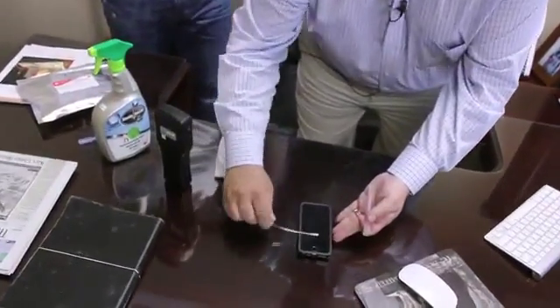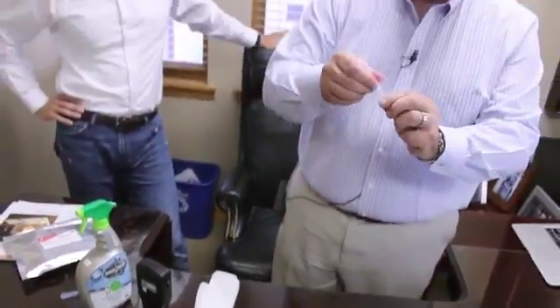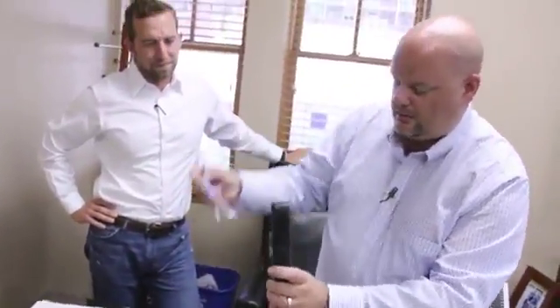So now that we've taken our pre-reading of Joe's phone and now we've treated it, we're going to do a follow-up test and see the results of the reduction. Another new swab. We're going to swab the same areas that we tested before and treated. Put it back into the holder, snap your top, shake your product, and in 15 seconds, we'll see the results of how the product worked. The result of Joe's phone after treatment went down to 59, which is a passable rating.